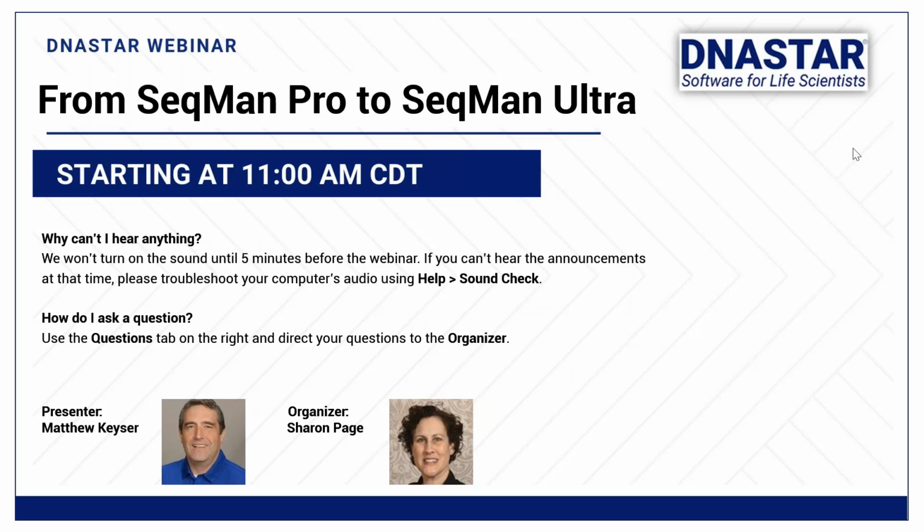So we did redesign some of the interface, especially where you get started in SeqMan Ultra. So we'll focus there a bit today to show you the entry points into the software, how we've updated them to be more consistent with modern software.